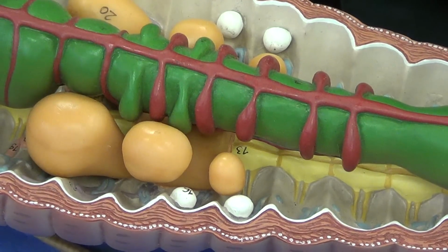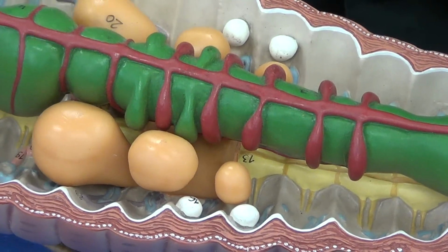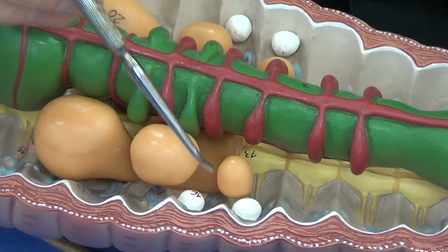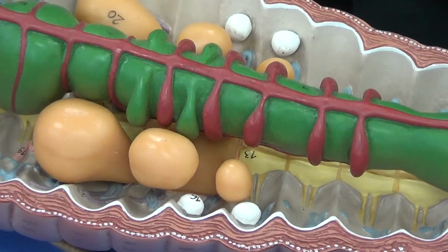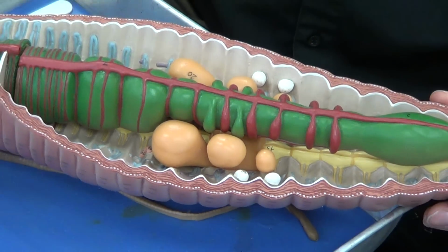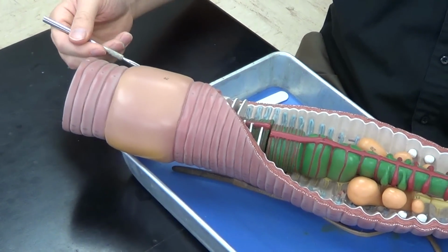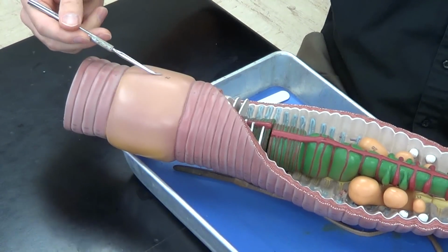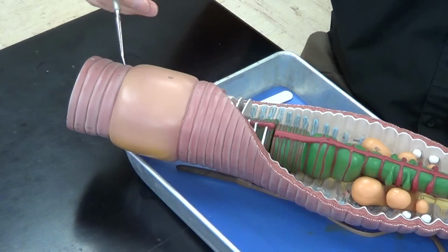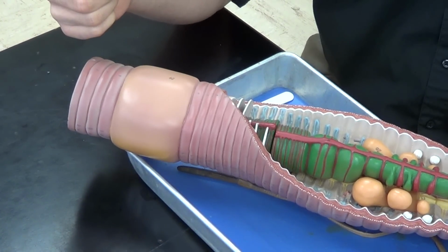They call them receptacles because their job is to receive something. They actually receive the sperm of another earthworm. And they store that sperm temporarily until the earthworm is ready to fertilize its own eggs. Now, keeping with that thought, we've got another large prominent structure here on the external surface of the earthworm. You can see this band of tissue right here, and this is called the clitellum. And its job is actually to secrete a viscous material that will eventually become the cocoon. And inside the cocoon will be the fertilized eggs.